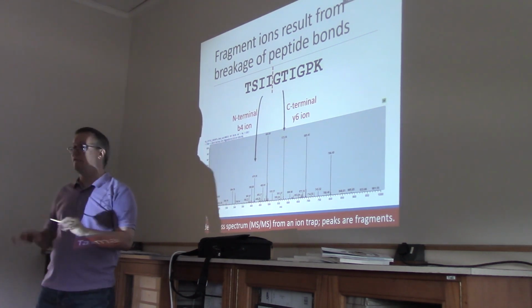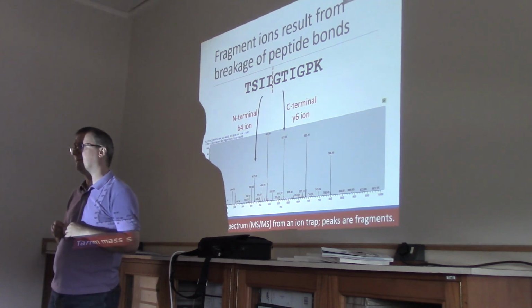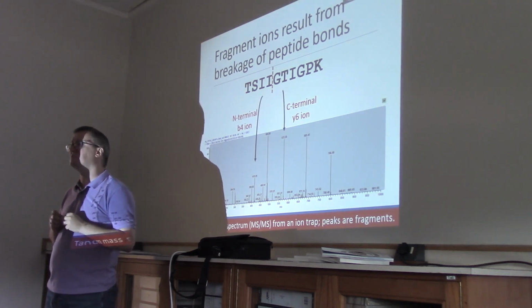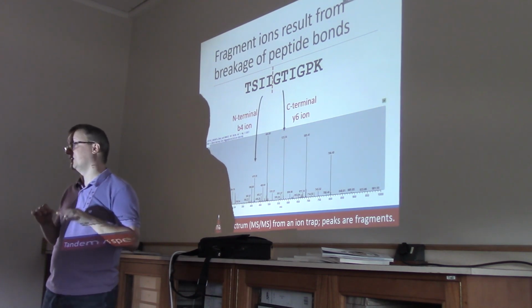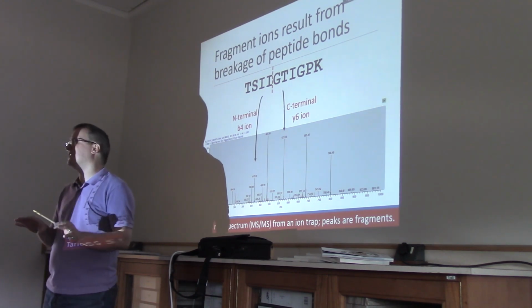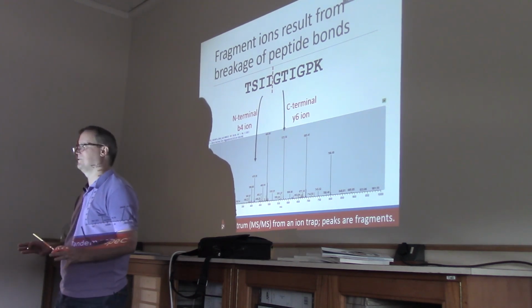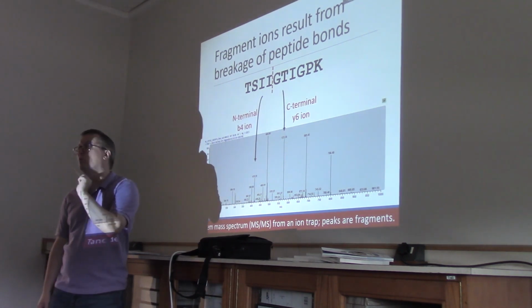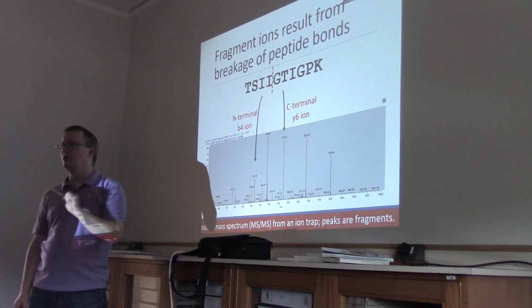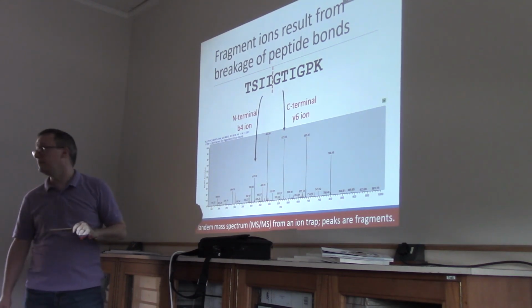Now, is it easy for you to simply read this spectrum and infer what sequence created it? I spent a whole semester-long course learning how to do that, and let us describe that process as difficult. Right? De novo sequence inference is feasible. You can even do it with software, but it is not straightforward, and it's not for the faint of heart. It requires a good calculator and patience. So, we would like not to try to infer these sequences, but I'm going to go one step further in trying to show you that these peaks that we see here are indicative of the sequence.